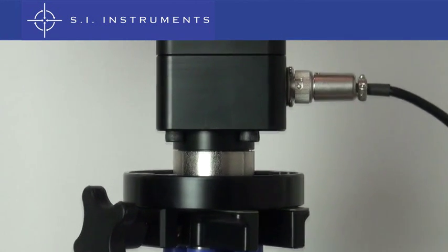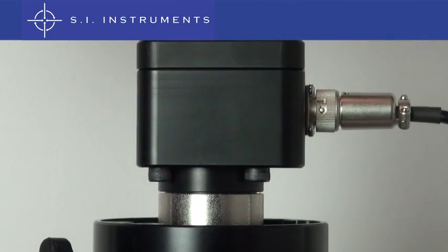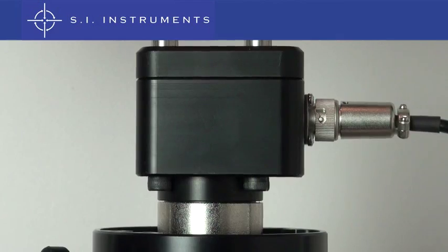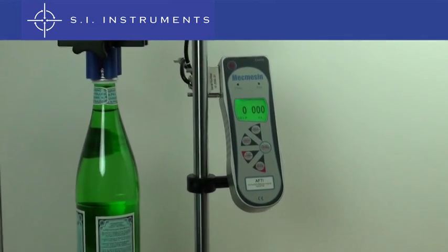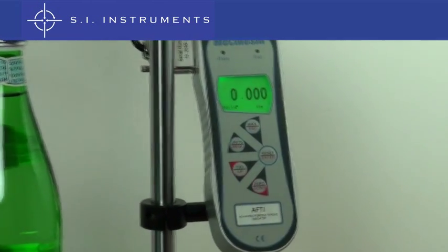The cap holder is mounted underneath the torque gauge. Different capacities are available. The torque gauge is connected to the McMesson Advanced Force and Torque Indicator with the crisp LCD display.